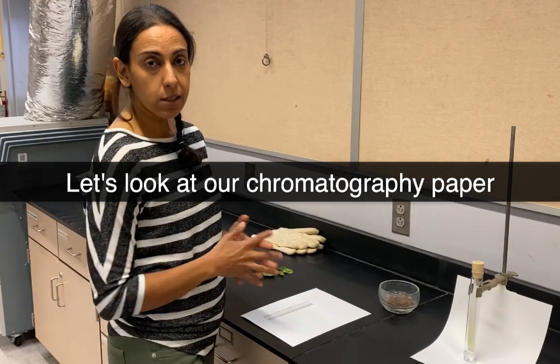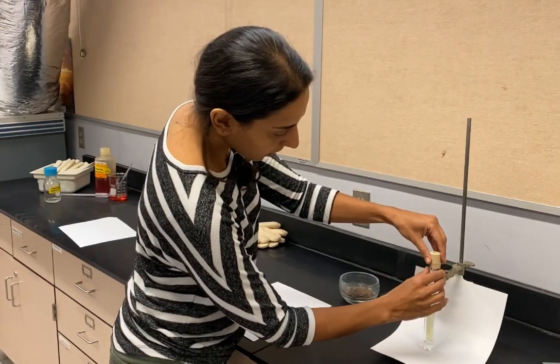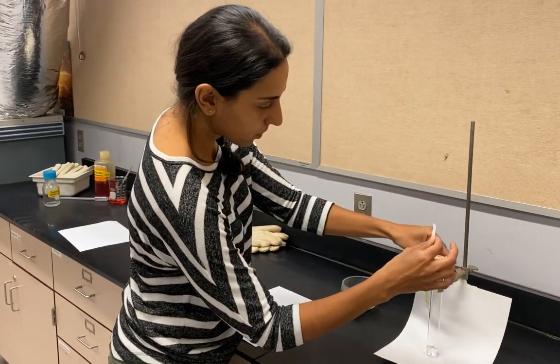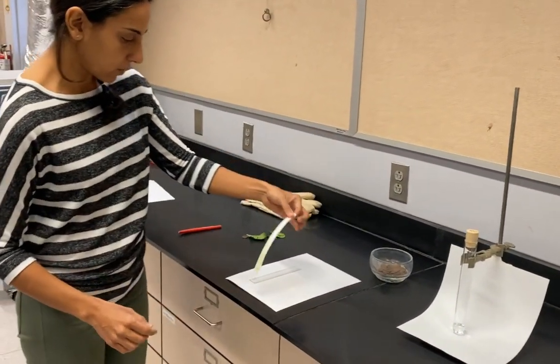All right, so we're going to look at our results for experiment two. We have our pigment here that's separated now in paper chromatography. It looks like there's a good separation there, so I'm going to bring this over here on this piece of paper.